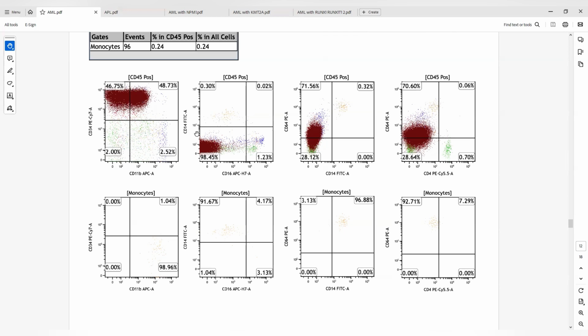However, it can be lost in immature monocytic cells like monoblasts. This population here is completely CD14 negative. CD64 positivity is seen in monoblasts as well, especially if it's bright expression. Our CD64 is dim, and CD4 can be expressed on monocytic cells, but CD4 is negative.